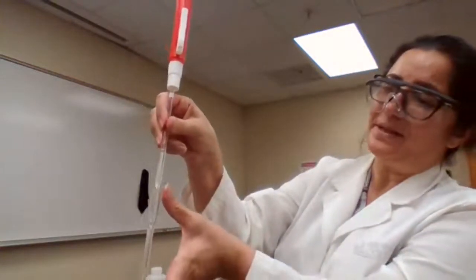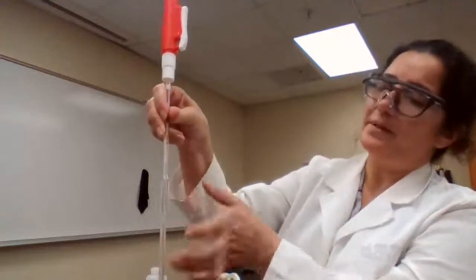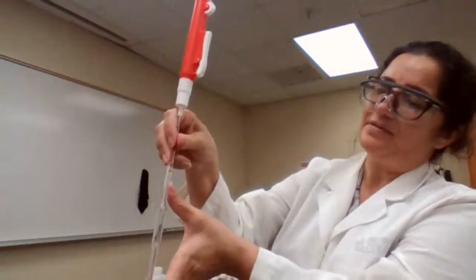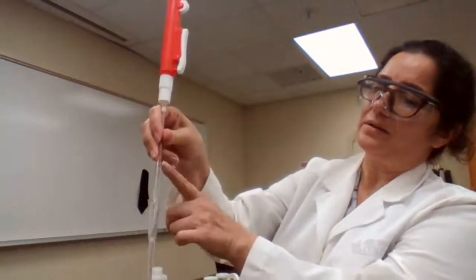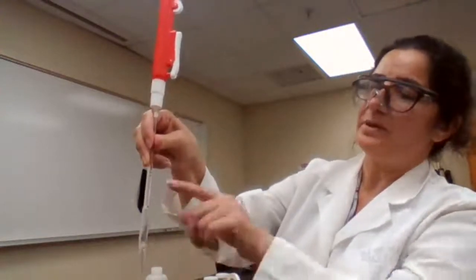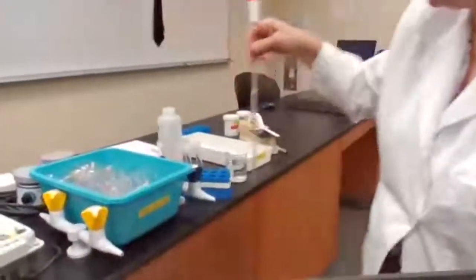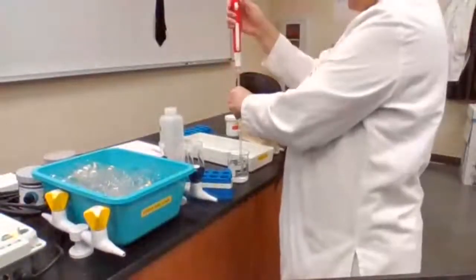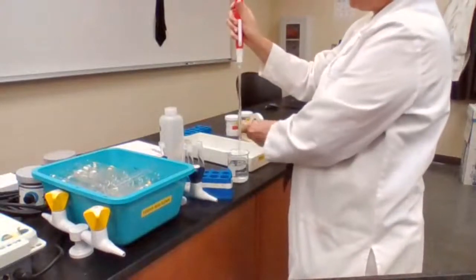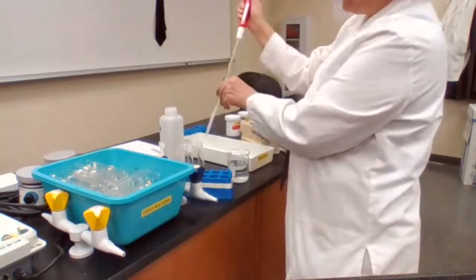This is a volumetric pipette, not a graduated pipette, and the size is 5 milliliters because we have the 5 milliliters written here. If we fill it up to the index line, it is going to be 5 milliliters. So I'm going to add 5 milliliters of water to each test tube. Okay, I have 5 milliliters.